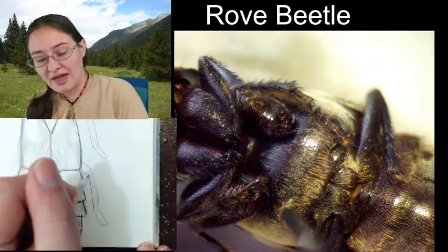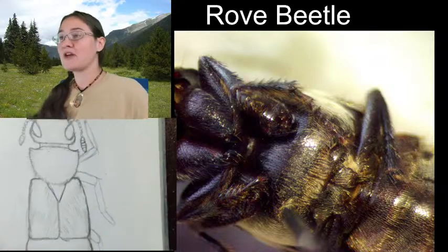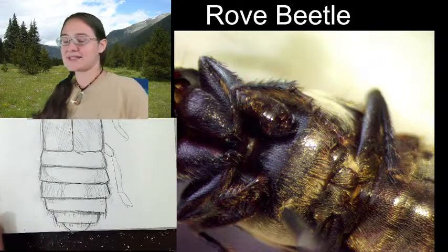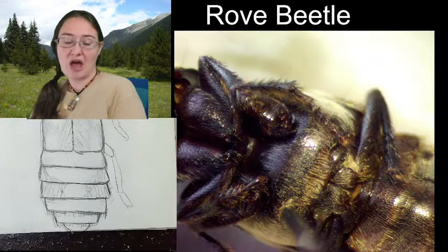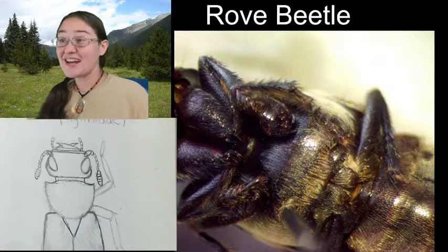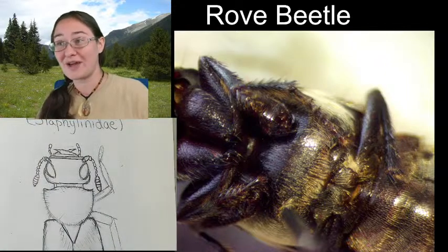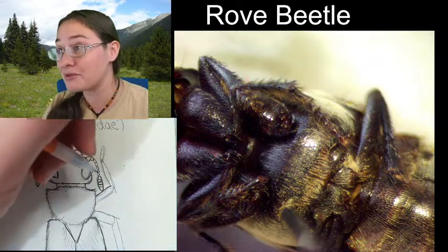And so that large gap right there, you can see that if my beetle had all 6 of its legs up here, it would be kind of bottom heavy, right? Or like it would feel like dragging its abdomen. But having its hind leg a little bit further back is going to help balance out its body weight and give it the ability to run. And it's a predator, right? So it's gonna have to run. It has to sometimes chase after its prey, or at least be quick. Rove beetles do go after springtails, and those guys jump, right?